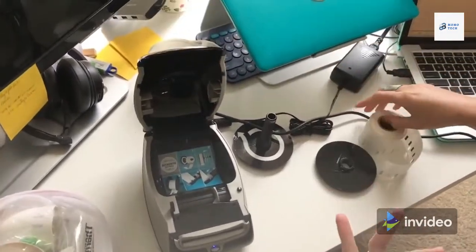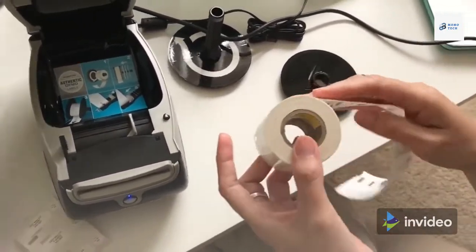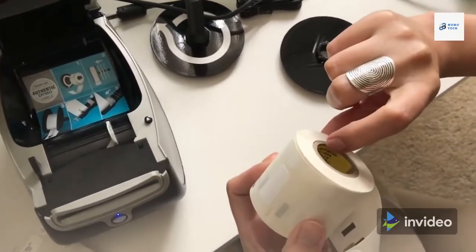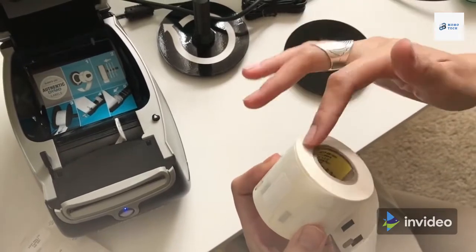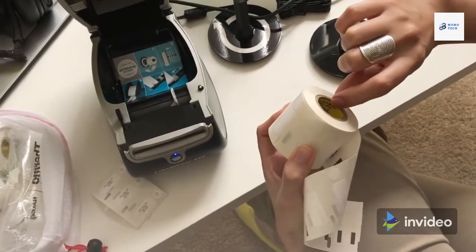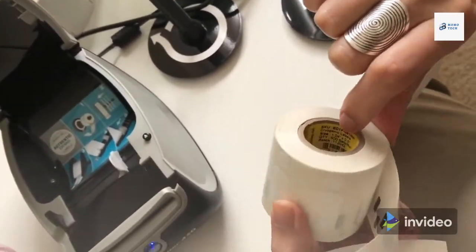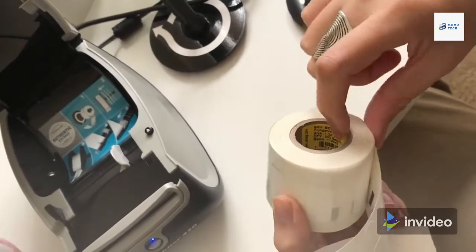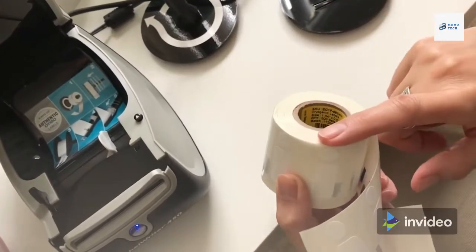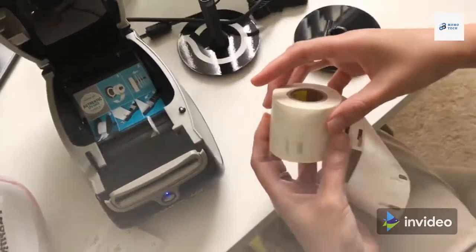The ones that you probably will be using for the laboratory, because they are suitable for cryopreservation or chemical resistant, etc., are from the other company, and all the information is inside. So if by any chance you don't know, you just look here and you see the size and if they are cryogenic or not, etc. And then you can find all the information on the webpage of labtech.com. So always follow these and make sure that you're using the proper ones, because even though they look the same, there are some that are not suitable for cryogenic preservation.